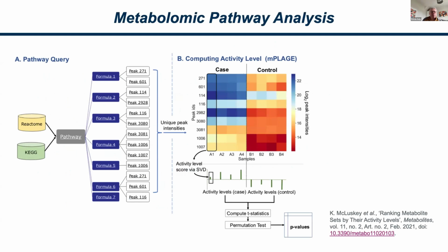Some more research we had done previously is on pathway analysis. For pathway analysis for metabolomics, there was never quite a huge amount of tools out there. We developed a tool ourselves here that was able to perform this type of pathway analysis on untargeted metabolomic studies using LCMS type systems. And we found that this works quite a bit better than other systems that have been developed mainly for transcriptomics type analyses.